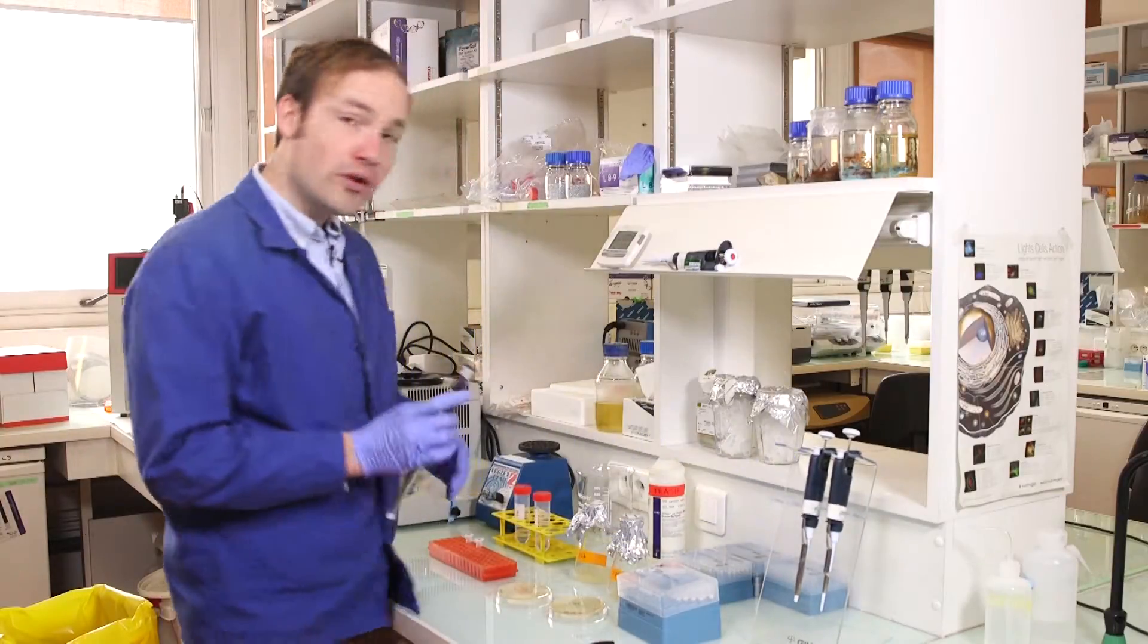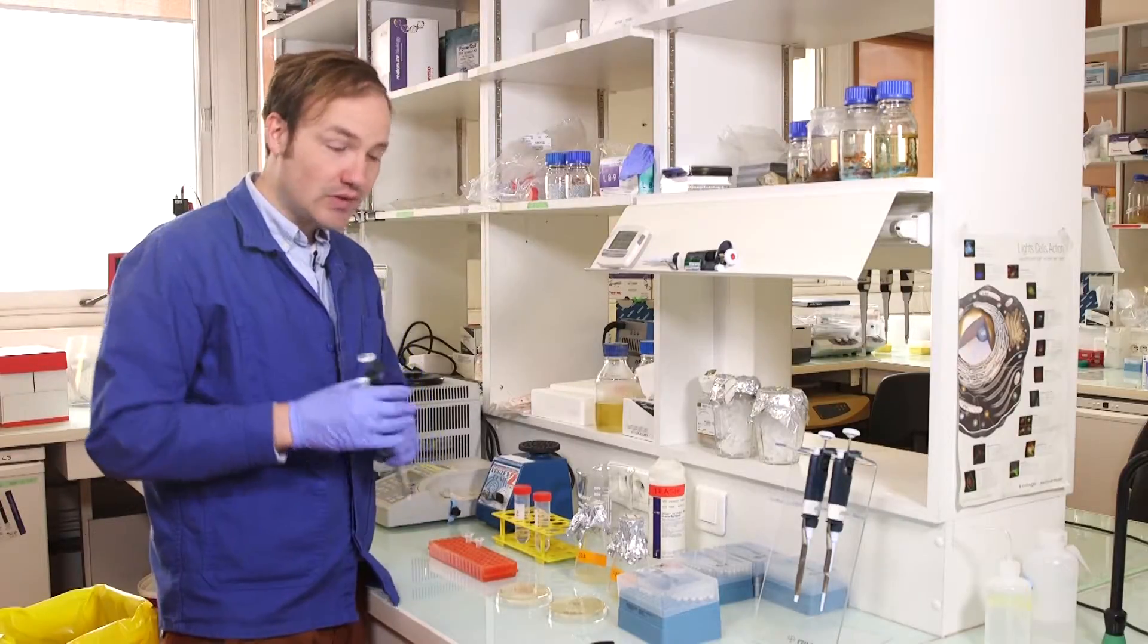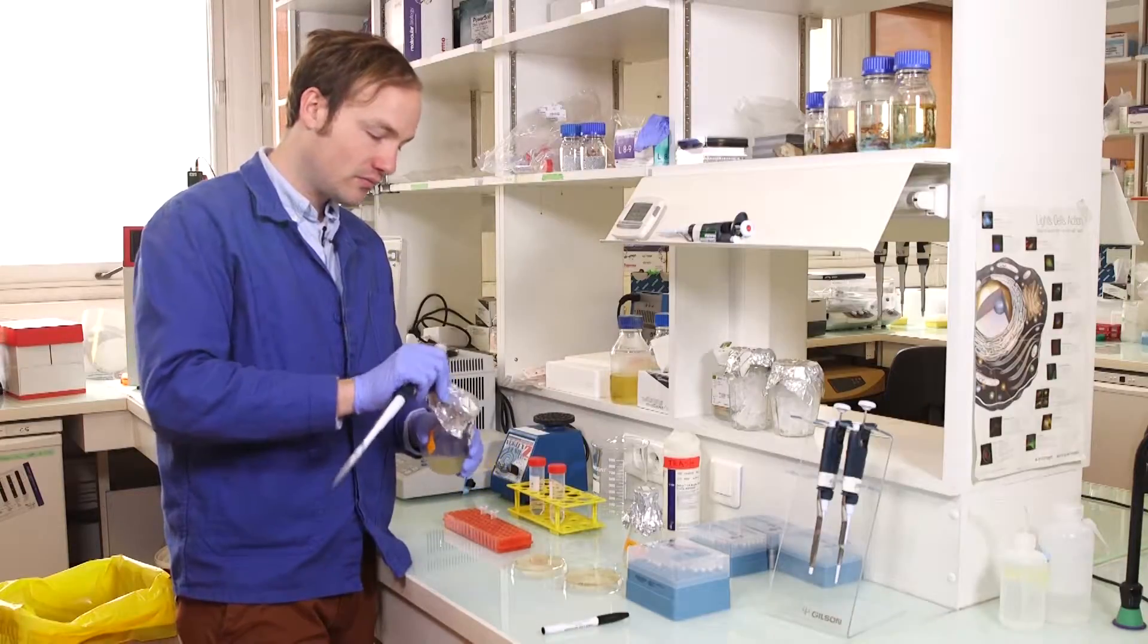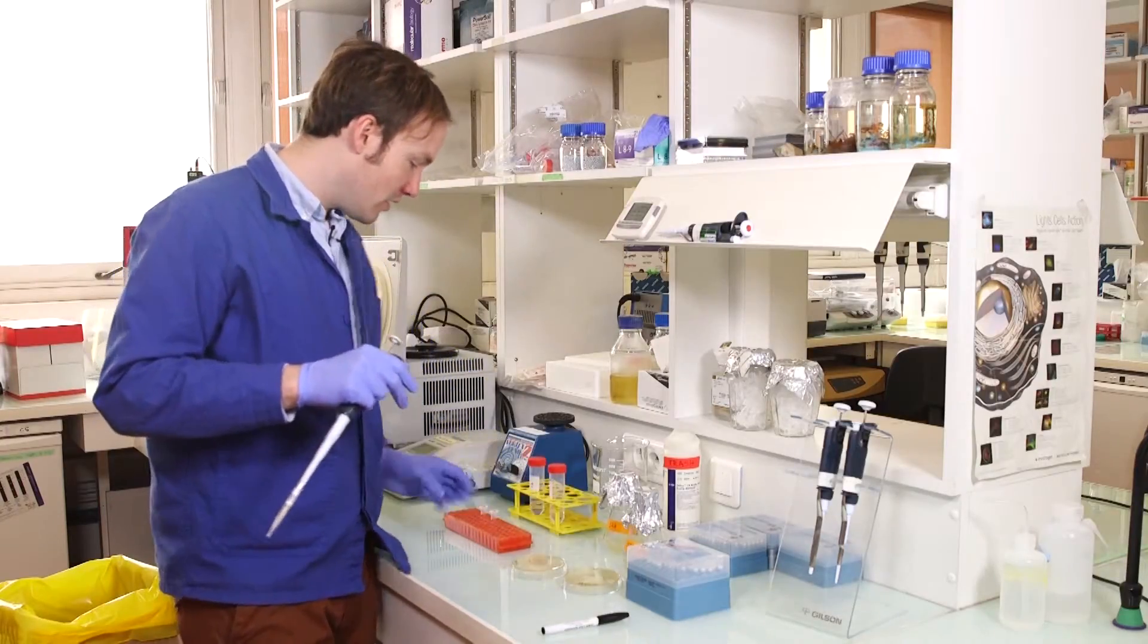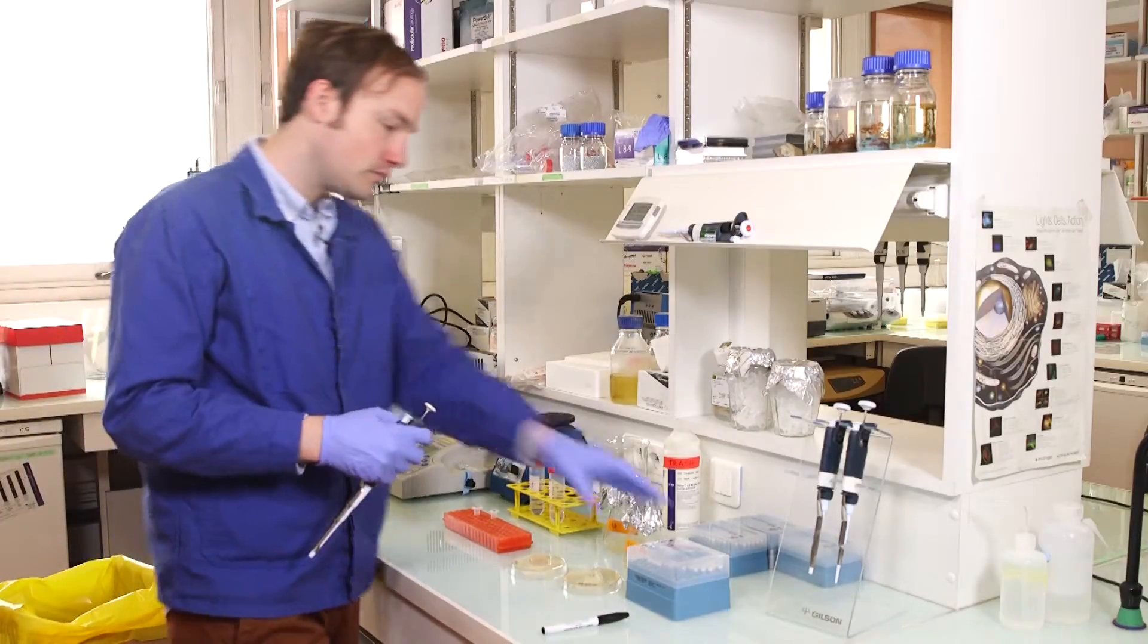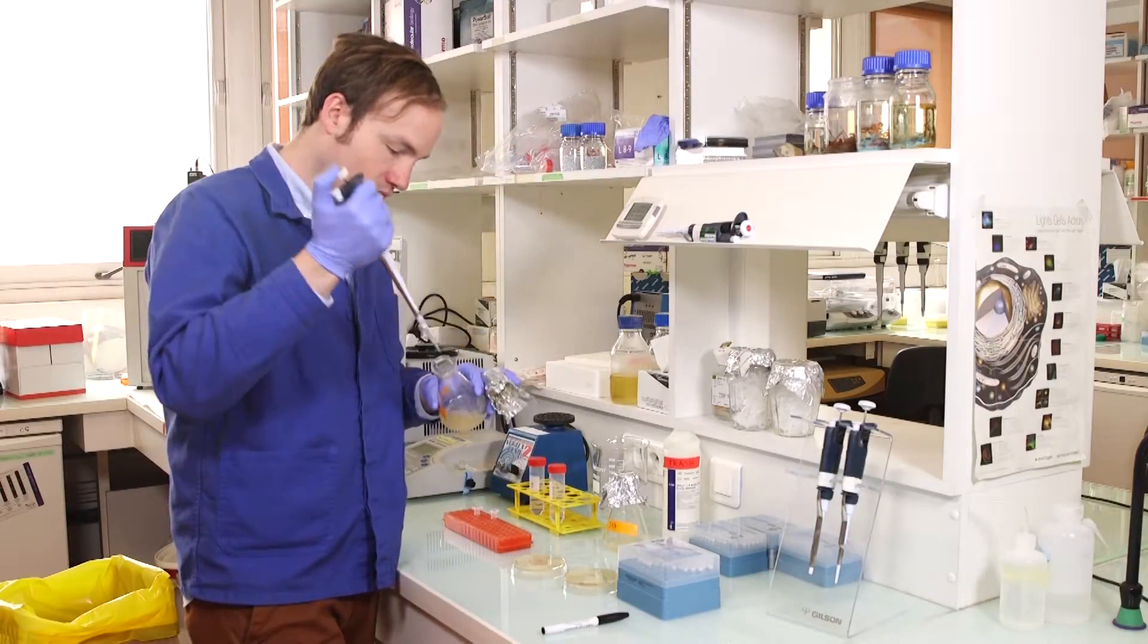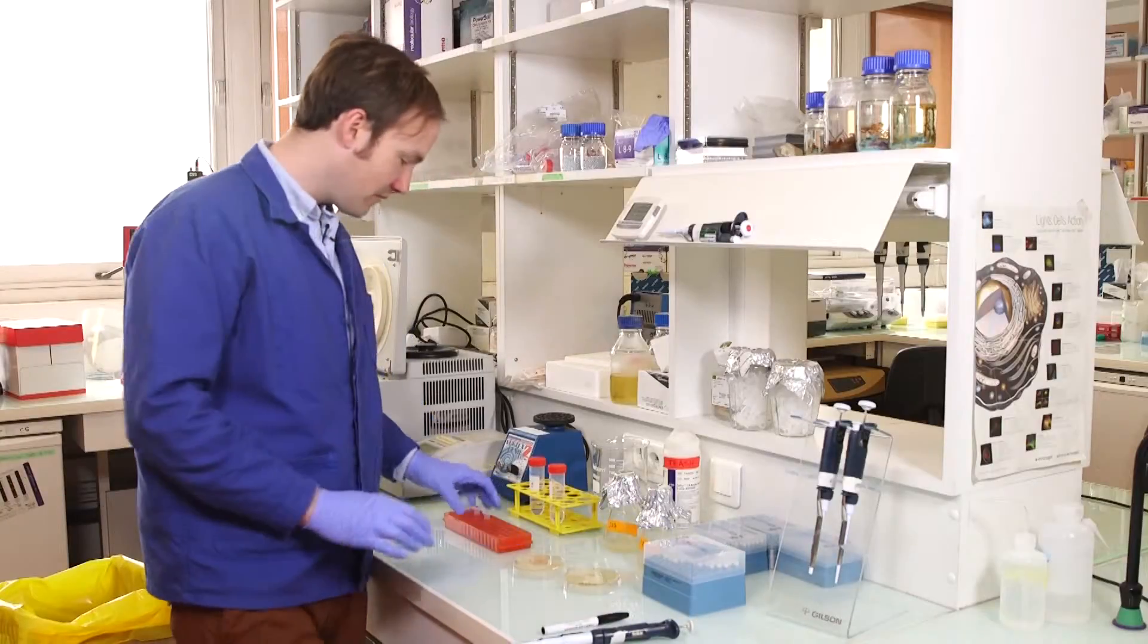Next step, take a 1 ml aliquot of each of these cultures. Our fluorescent measurement technology is very sensitive, does not require a large volume of cells. One ml is going to be more than enough. Take my 1 ml of cells, transfer it to a 1.5 ml Eppendorf tube like this one, and don't forget to label.